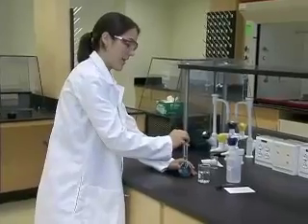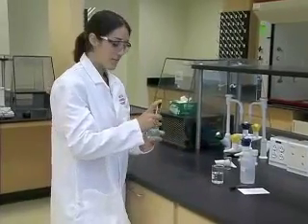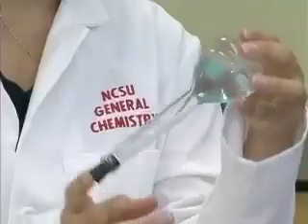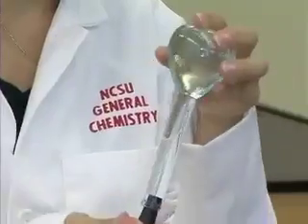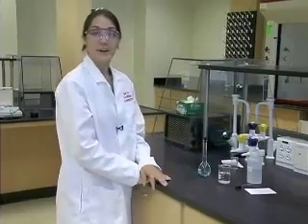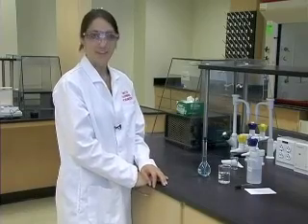We will then place the stopper back in the volumetric flask and invert several more times to ensure that our solution is properly mixed. That is the correct way to use the volumetric flask. Thank you for your attention.